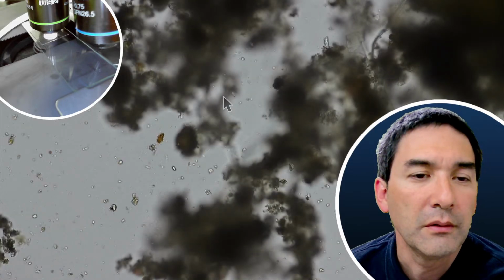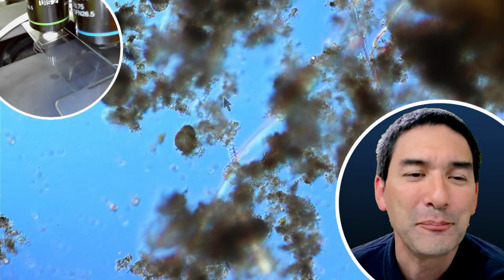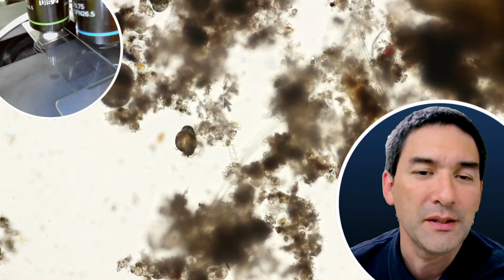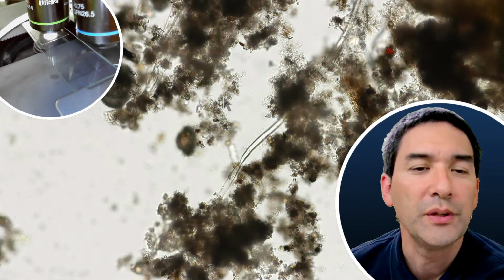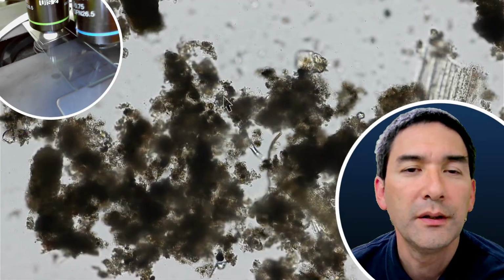Overall, the colorful appearance might appear subjectively nicer, but this can actually also be a disadvantage, as it covers up some of the more interesting specimens. So I always have to play around a little bit with the condenser. Here we've been already.